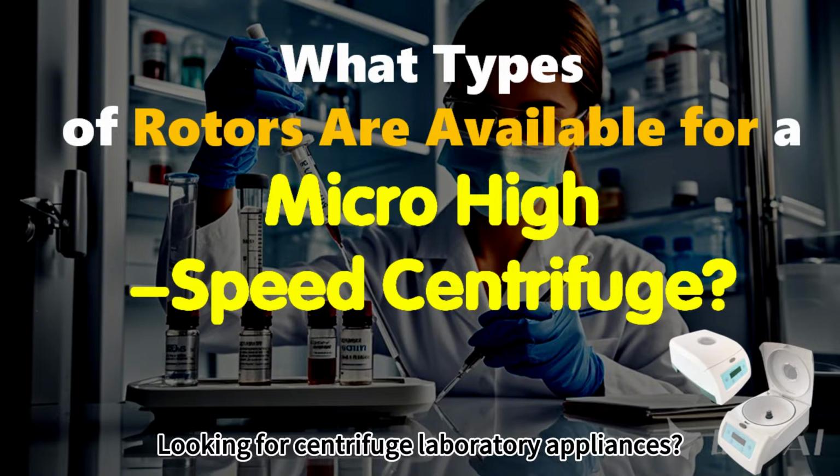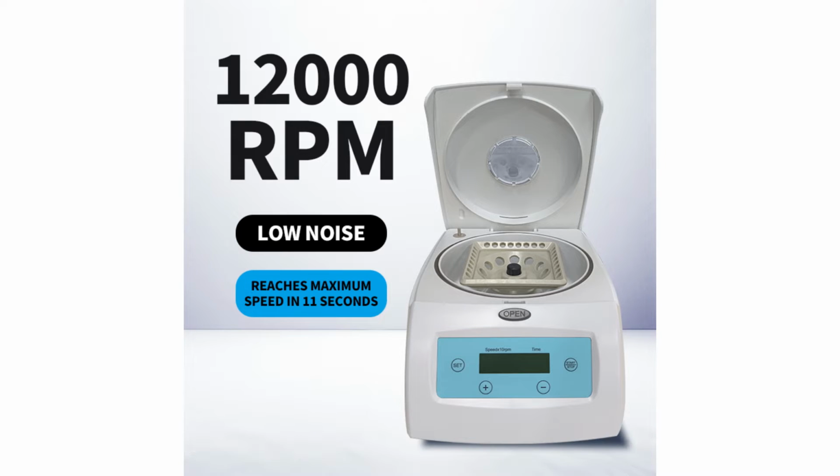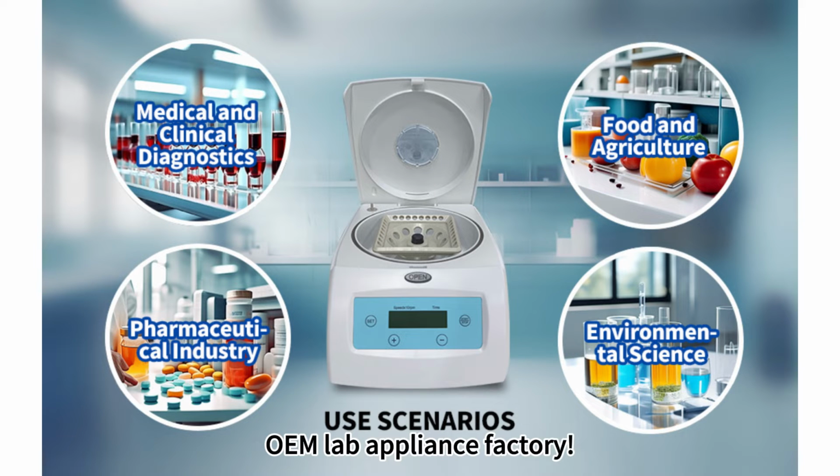Different rotor types are suitable for handling various types and volumes of sample containers. Types of rotors. Fixed angle rotor. Description: samples are held at a fixed angle relative to the axis of rotation. Suitability: ideal for separating dense particles quickly.